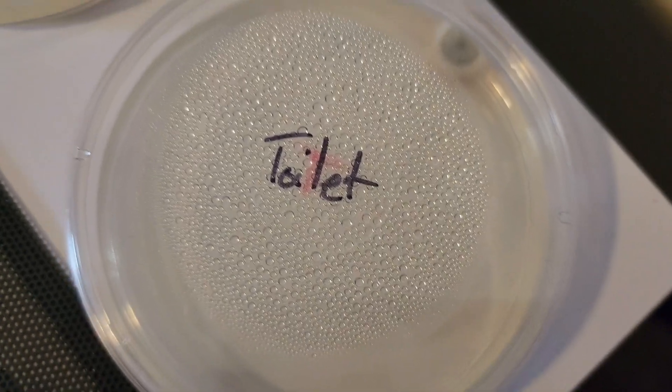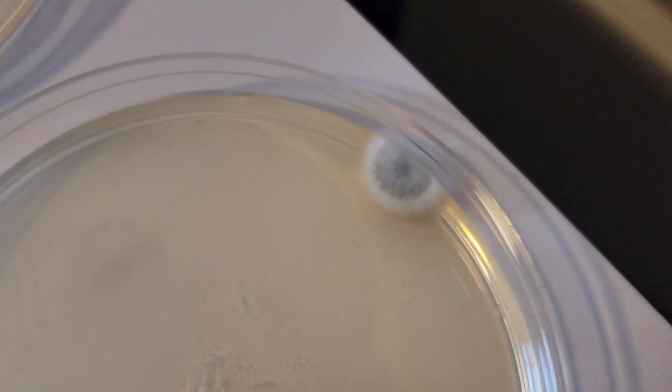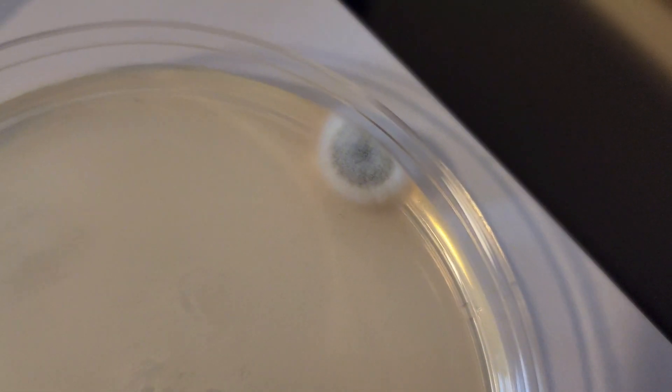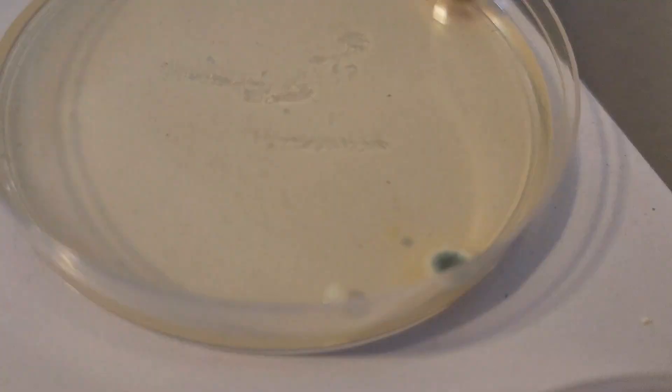I had originally planned to do five days but we are going to stop at three because I'm starting to get grossed out by this and it's not really normal to grow bacteria in your apartment. Let's be honest, I didn't do everything textbook and I completely acknowledge that, but we did what we needed to accomplish — knowing that there are some nasty things growing on gym equipment and especially climbing holds.